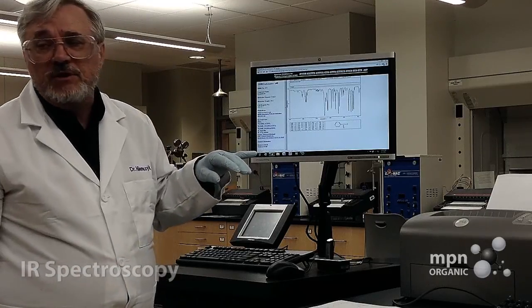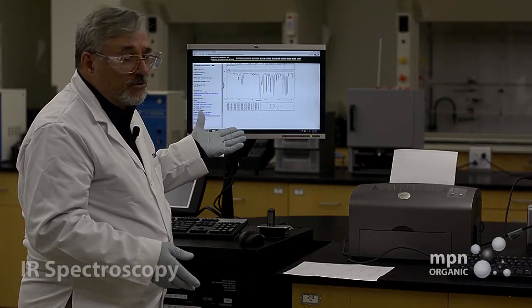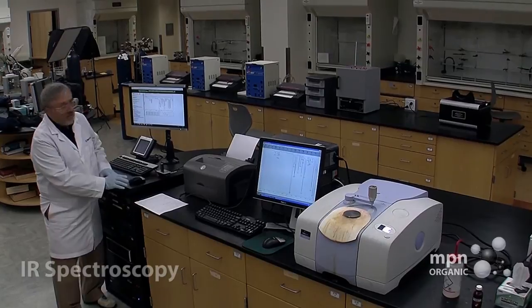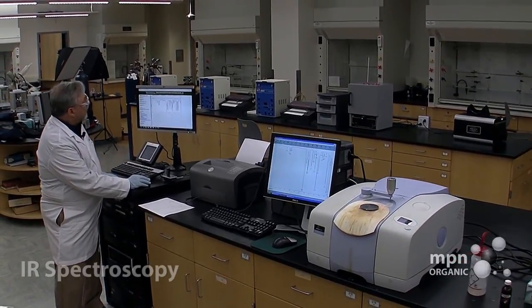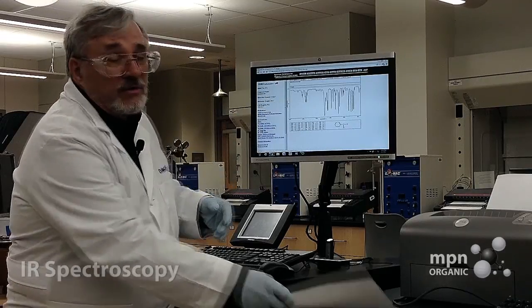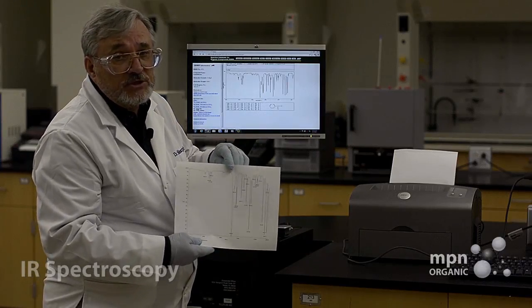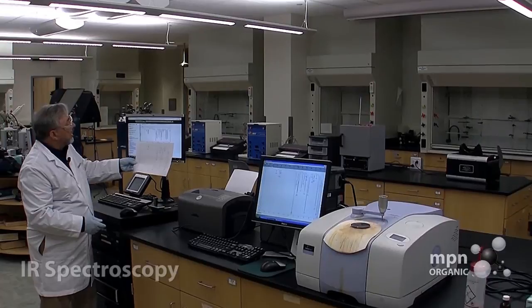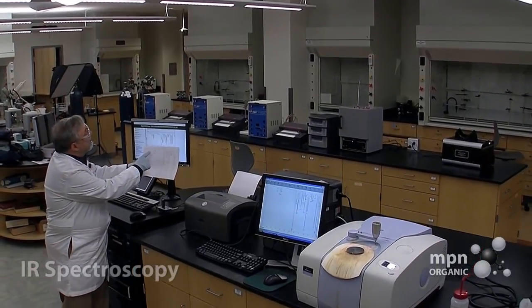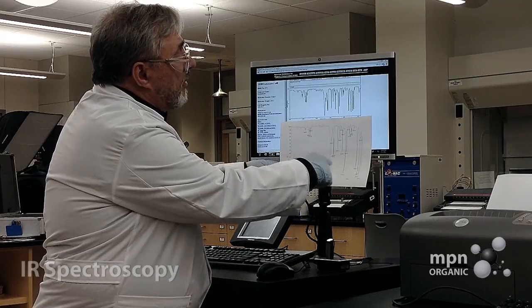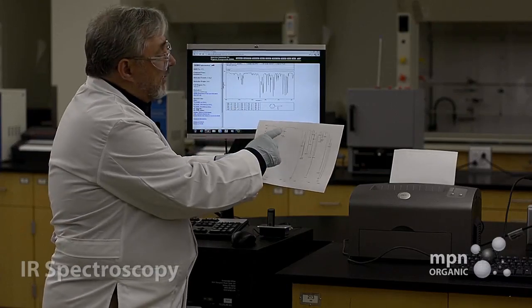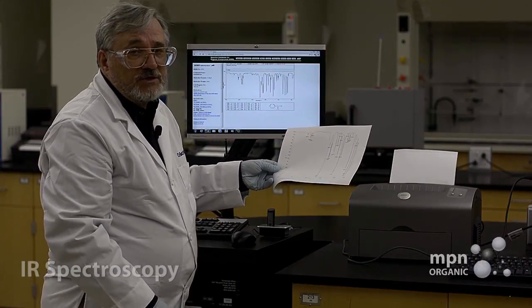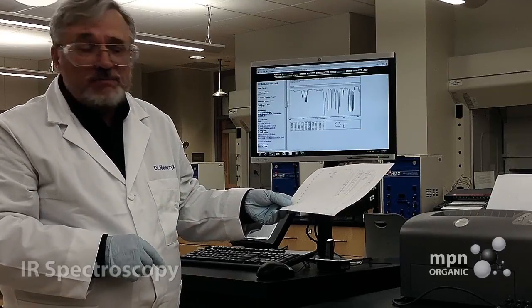And here we have the infrared spectrum. Now, there are two types of infrared spectra that are available to us. In this case, we have what's called a carbon tetrachloride solution. We don't want that one. We want the one above it, the liquid film. So we click on that, and this is what we're going to compare our infrared spectrum that we just took with the published spectrum, which we have right here. And you can check and see that just about every peak, even little tiny ones, are represented on this particular published spectrum that gives us assuredness that that, in fact, is the infrared spectrum of benzaldehyde that we just took on our infrared spectrometer.